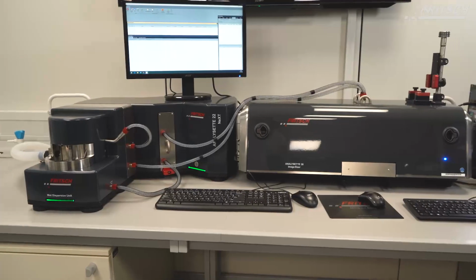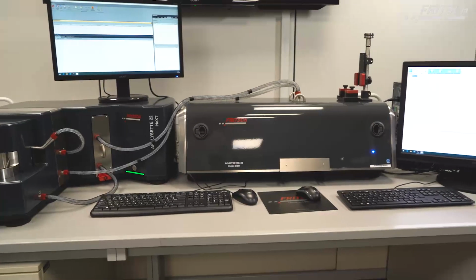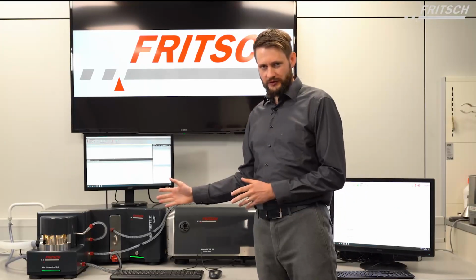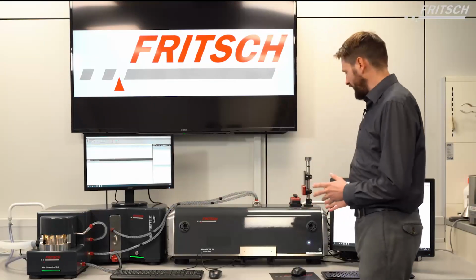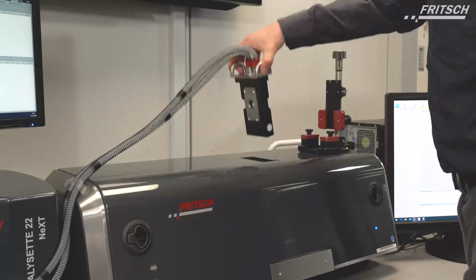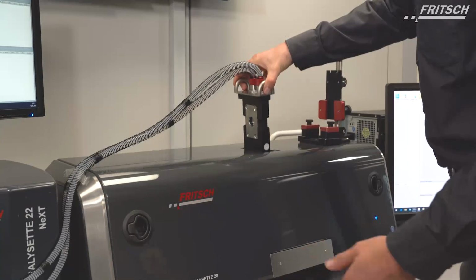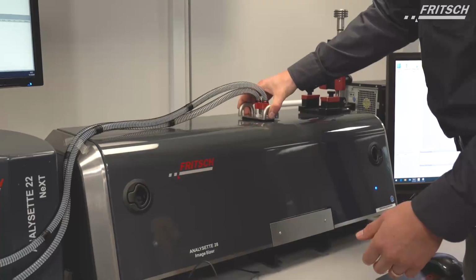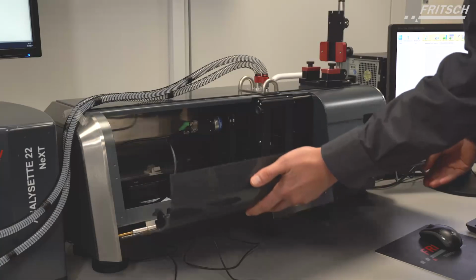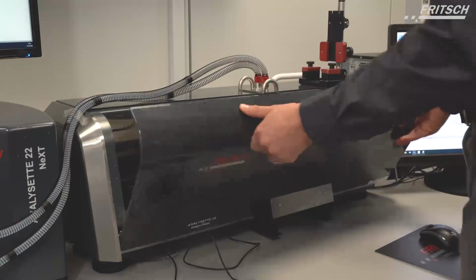If you like to order the system in the way that it is set up now in our lab, what you need is the A22 including the wet dispersion unit and the A28 with the addition of the wet measuring cell and also the according objective for wet measurement.